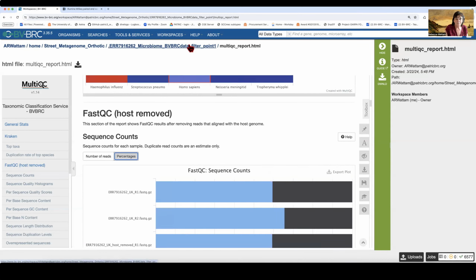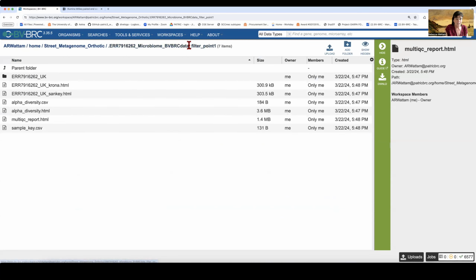So let's go back up, click on this. And now we can talk about diversity. There's a lot of talk about diversity, but we're talking about diversity here and looking at the microbiome report. Now, the Bracken report does 5 different statistical tests looking at diversity, and it's trying to figure out if there are a lot of organisms in there or very few organisms. So you could look at the diversity statistics and determine that. And also if they are widely spread taxonomically or very narrowly spread.